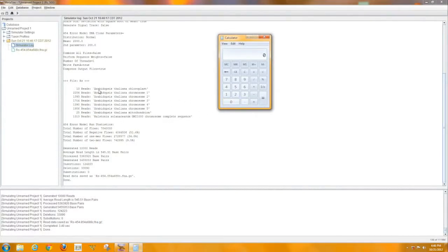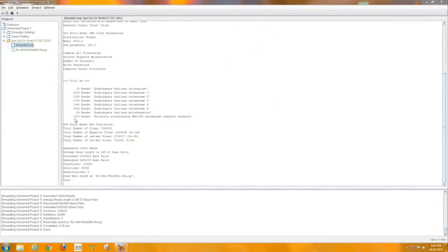Okay, now if you're curious, what's my total pathogen reads in this 454 run? Because we know we had 10,000 to start with, you can simply move the decimal point over, or you can plug in the numbers, so 1,313. You'll divide that by 10,000, and then multiply that by 100, and that'll give you the percentage of actual pathogen reads that you have in this 454 mock sample database. Okay, we'll go ahead and close this out.